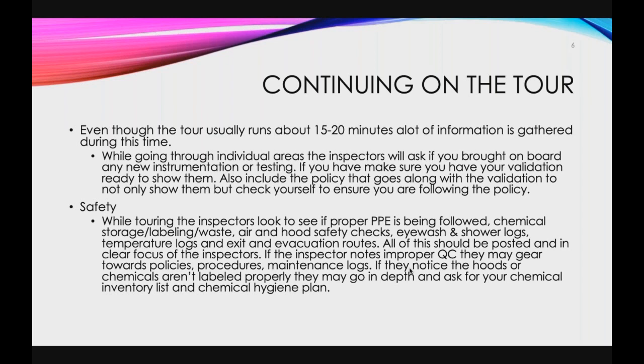Some of them have been in this field, they've had so many inspections. Some are very new. Usually the newer ones have the notepad and are taking notes and writing everything, and you can pretty much gauge how they are based off of these tours. They also look at the air and hood safety check, so usually that has a little sticker on it. They might glance at that.